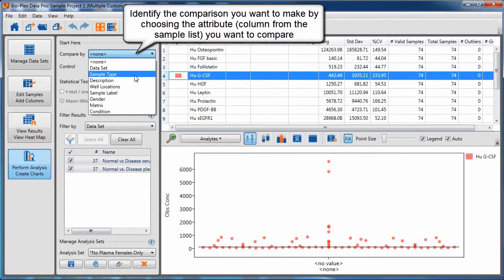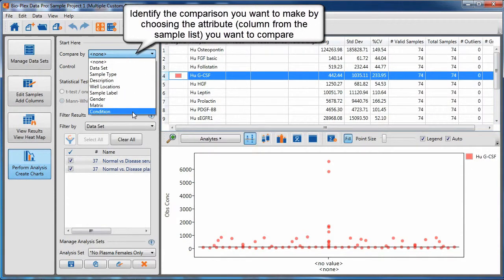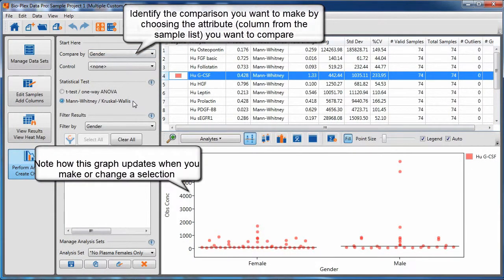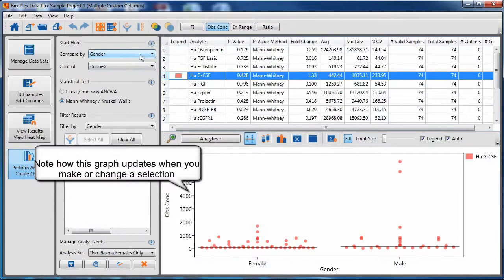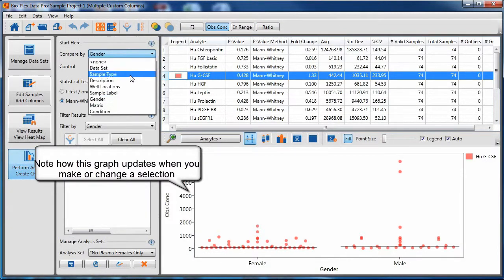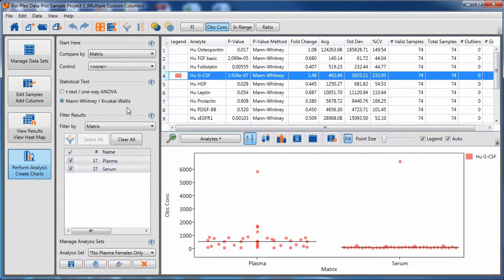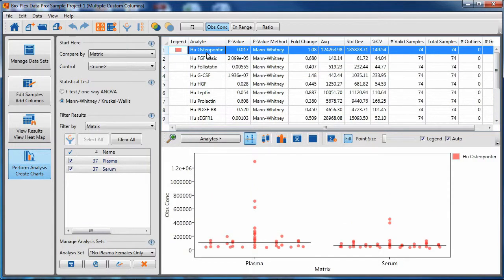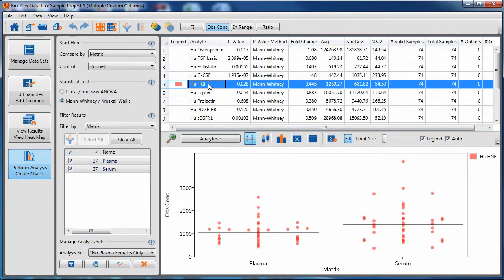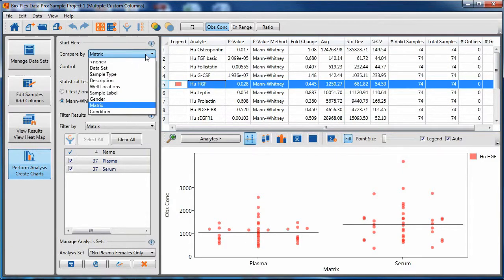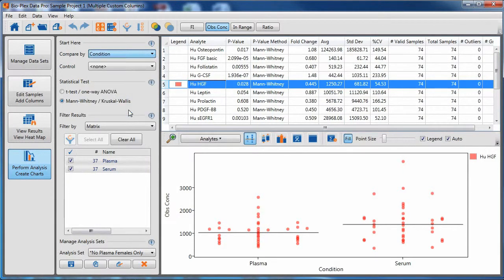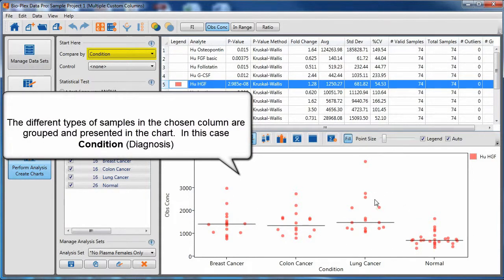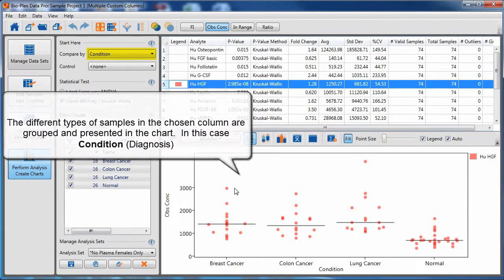Identify the comparison you want to make by choosing the attribute or the column from the sample list that you want to compare. Note how this graph updates when you make a change or a selection. In this case, I am comparing plasma and serum samples to each other. Now I have chosen condition or diagnostic state, and notice how each diagnostic state is grouped across the x-axis.